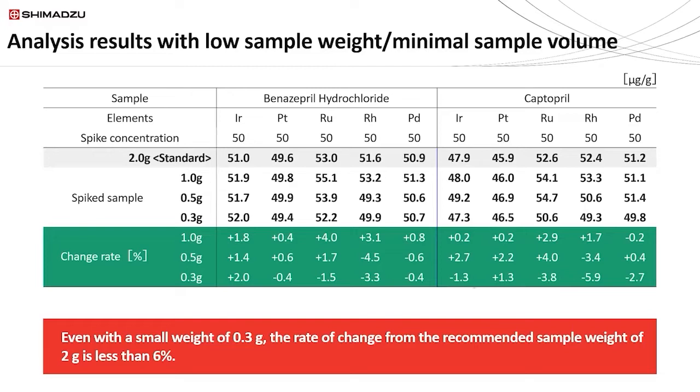Now, why is this important? In a manufacturing setting where you have different users, for example, that have different, for lack of a better word, tendencies, this is part of the proof showing that the method is very robust.